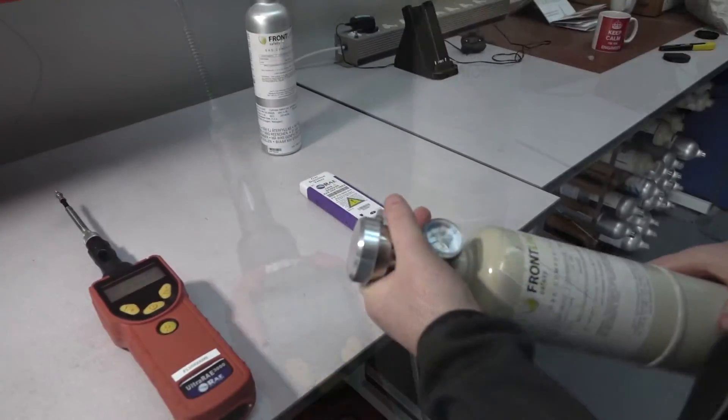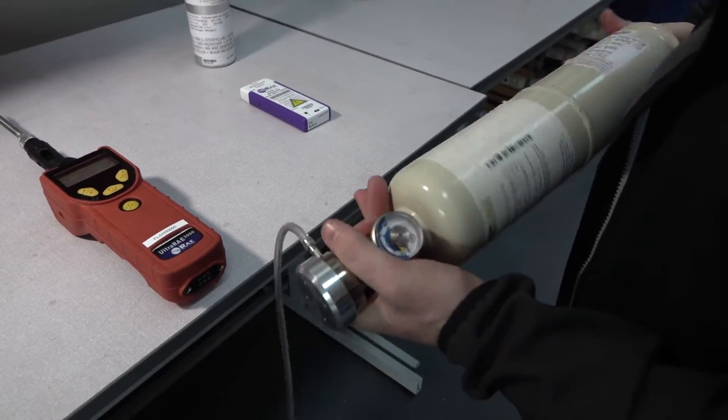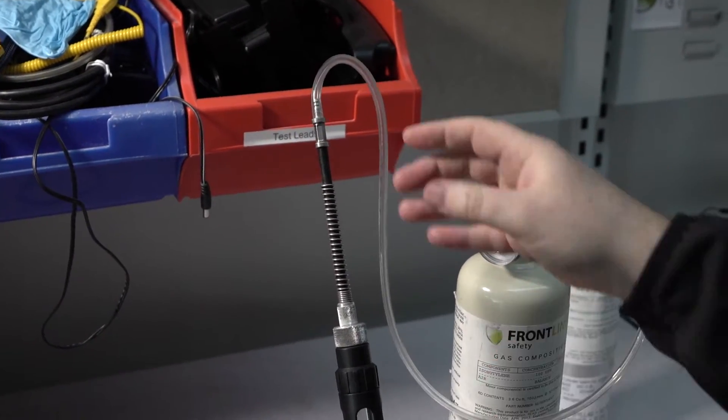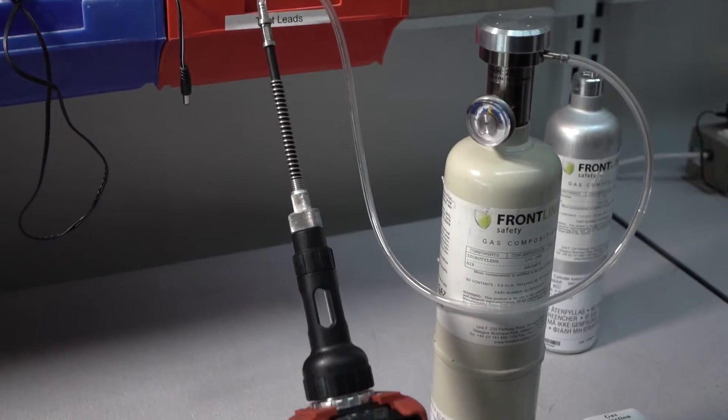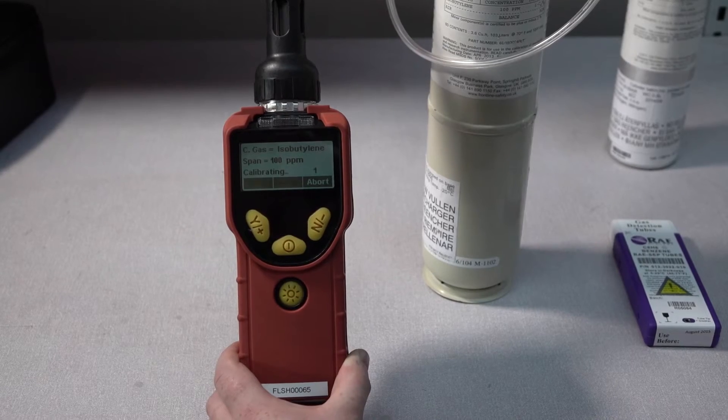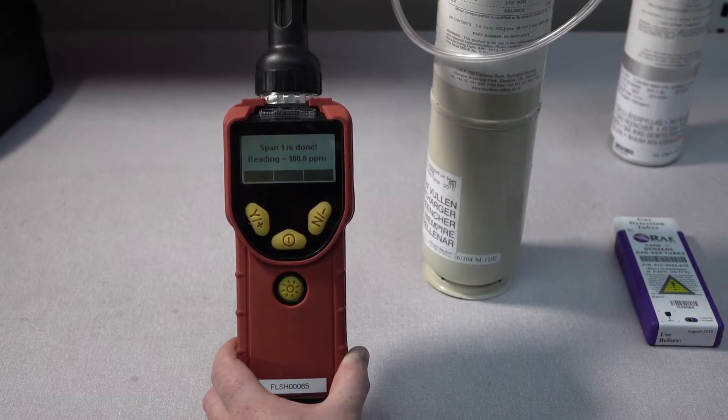You should also use a demand flow regulator and a piece of tubing. At this stage the device wants you to apply the gas. Now simply attach the tubing to the sensor. The device will count down 30 seconds as it calibrates, and now the calibration is complete.